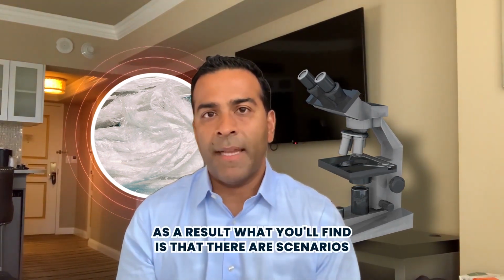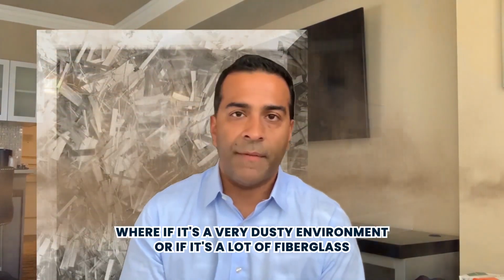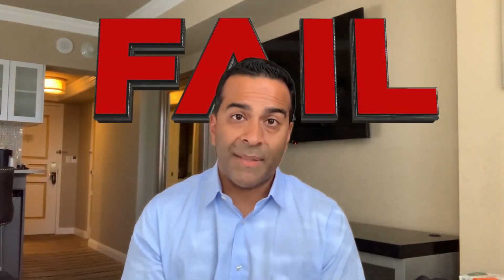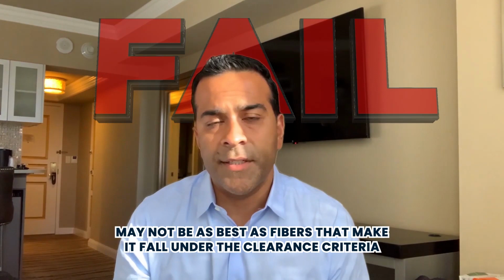As a result, there are scenarios where, if it's a very dusty environment or there's a lot of fiberglass, those can also be counted towards the concentration, which can then make that sample potentially fail. It may not be asbestos fibers that make it fall under the clearance criteria.